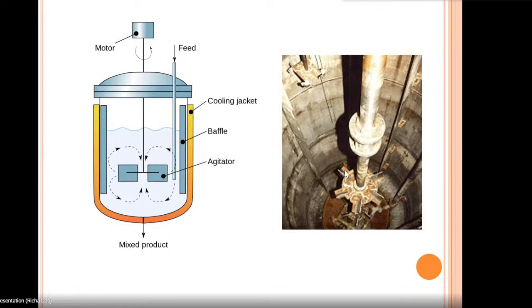Now let me tell you what the function of the baffles is, because actually baffles are also used for mixing the contents. But the question might be: if impellers are already kept inside the fermenter for mixing the contents, then why do we require baffles? The answer to this question is that the impeller is occupying only a certain portion of the fermenter. So whatever contents are within the reach of the impeller, only those contents will be mixed.